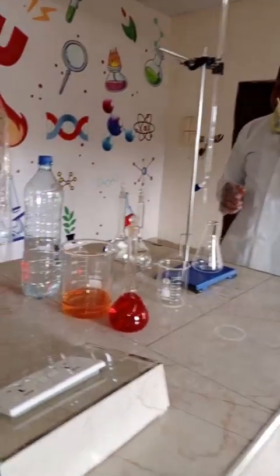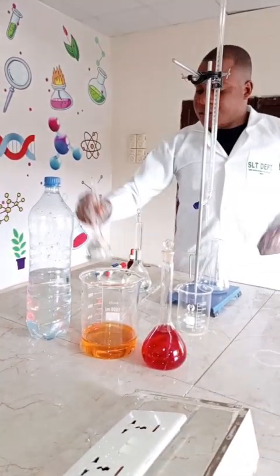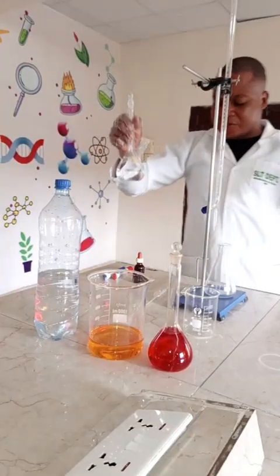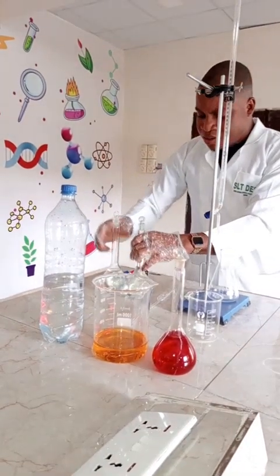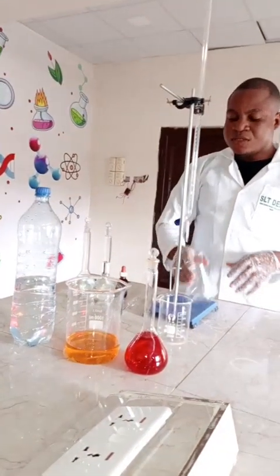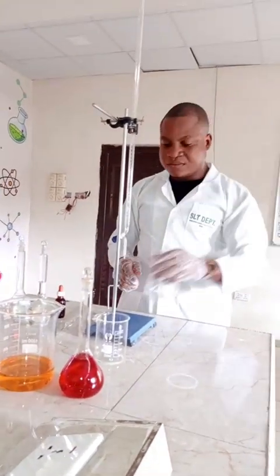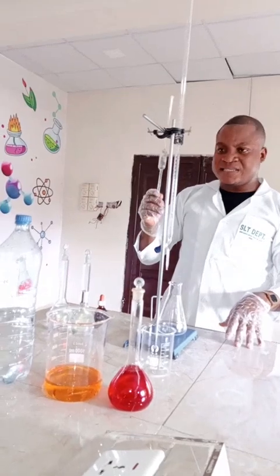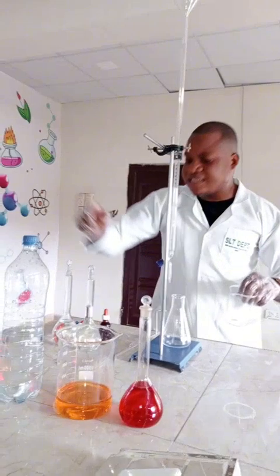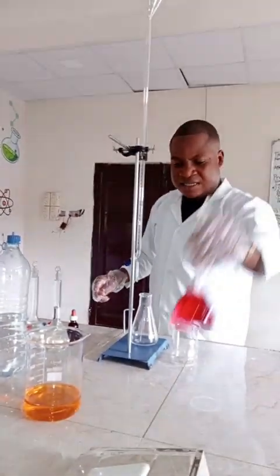Now this is our workbench. The solutions are already prepared. Here is our HCl acid. Here is our sodium hydroxide. Here is our indicator, the methyl red material. Here is our titrating flask, or the conical flask. Here is our pipette. Here is our beaker, and this is our distilled water. This is my stock solution for my material.